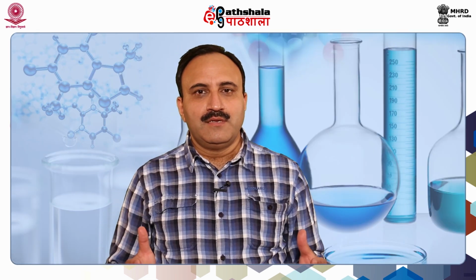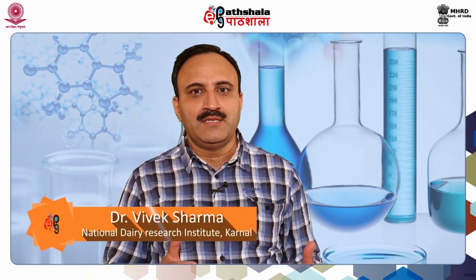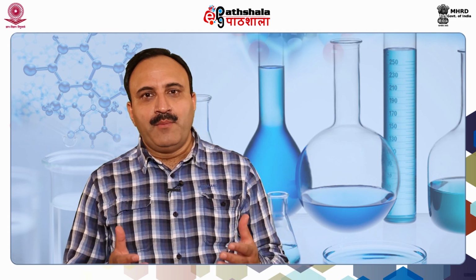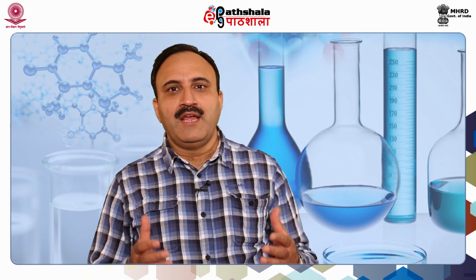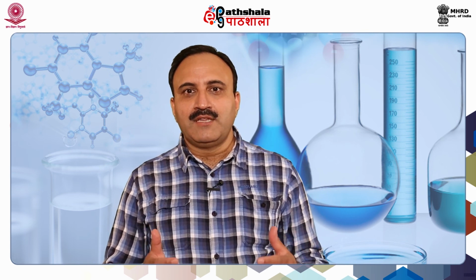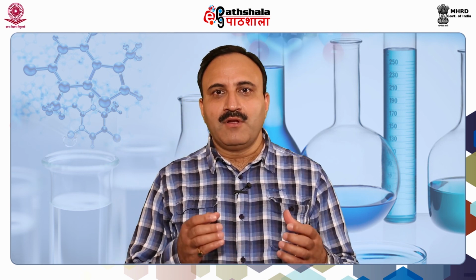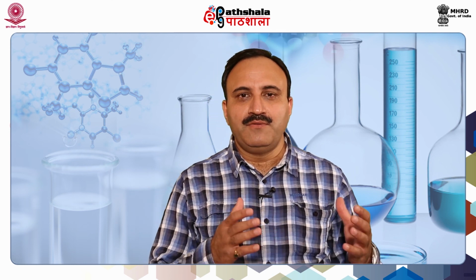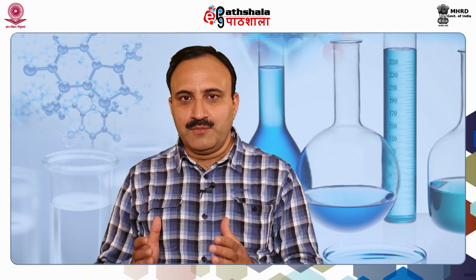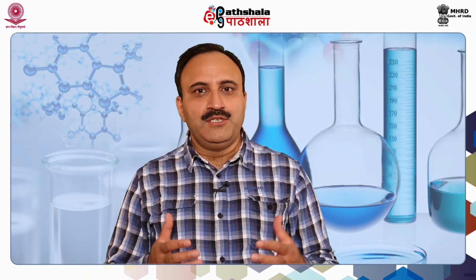Dear students, in this lecture we have learnt about the basic principles involved in gas liquid chromatography. We have also learnt about the different components involved, whether detectors or injectors, and what the limitations of the detectors are. We have also learnt about the different types of columns and stationary phases used in filling the columns. Now we are prepared to start our work on GLC.